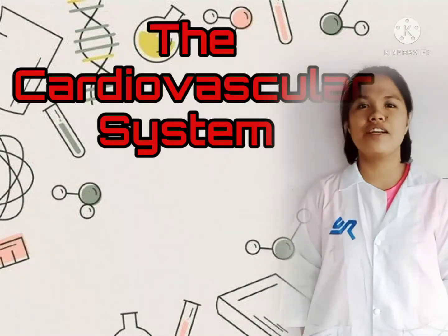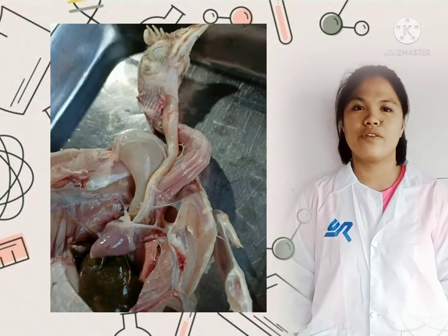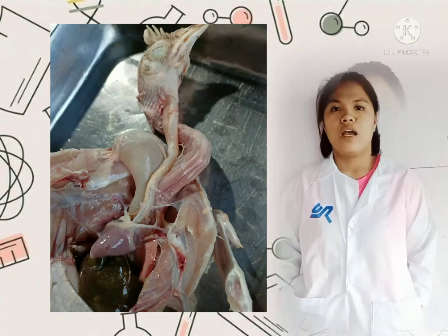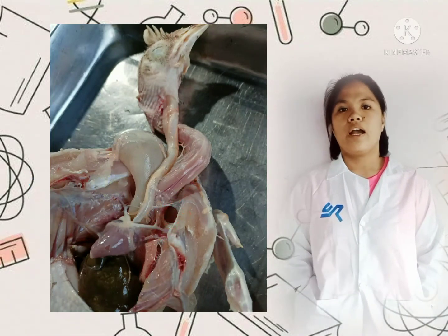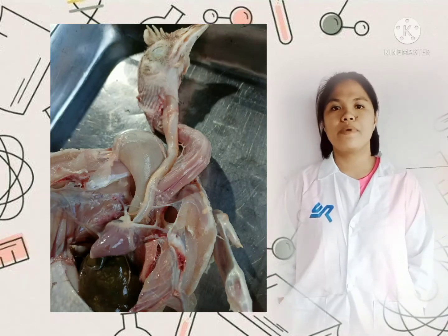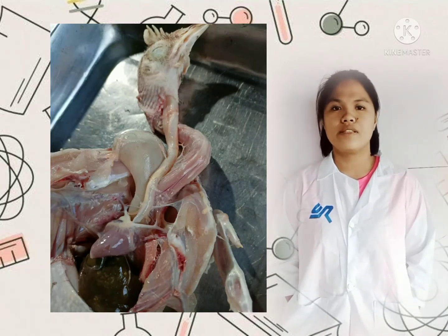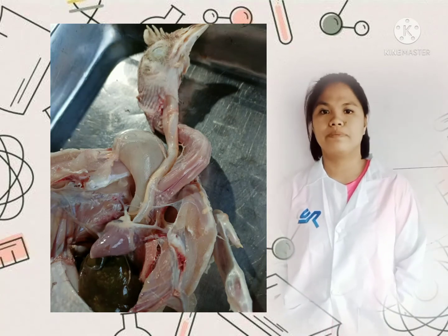The cardiovascular system. It consists of the heart, blood vessels, and the blood. The primary function is to transport nutrients and oxygen-rich blood to all parts of the body and to carry deoxygenated blood back to the lungs. The heart is a muscular pump that pumps blood around the body. A closed system of blood vessels. These vessels include arteries, vessels that carry blood away from the heart, the veins, vessels that bring blood into the heart, and capillaries, the tiny vessels that branch from arteries and deliver blood to all body tissues.